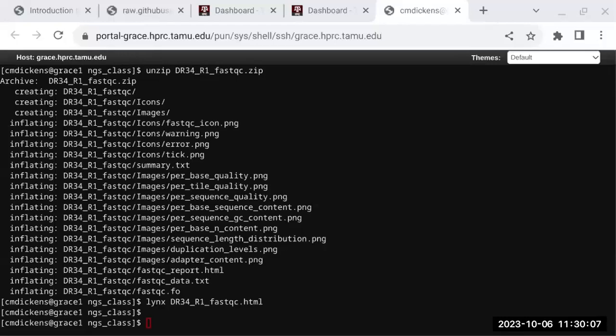So now you might think, oh, I need to trim the first 20 bases off here. But that's not necessarily the case. In this case, you need to know a little bit about how this sequence data was generated. Go back to the slides.